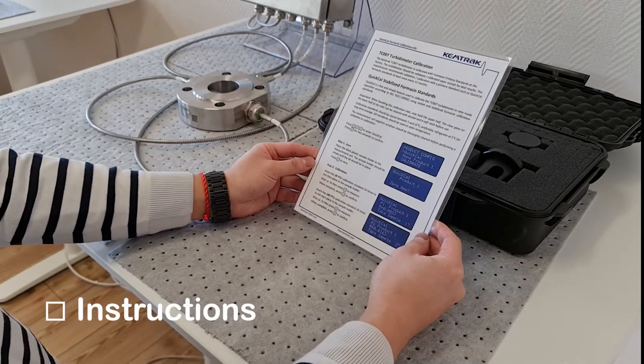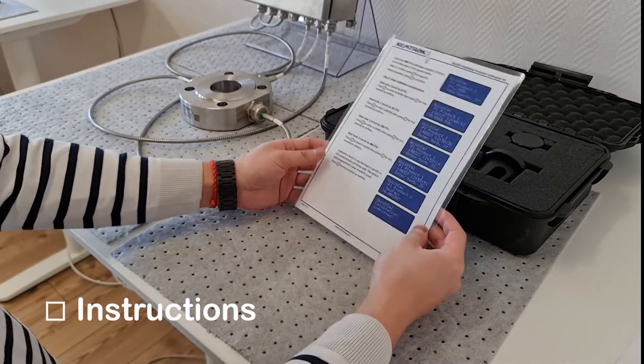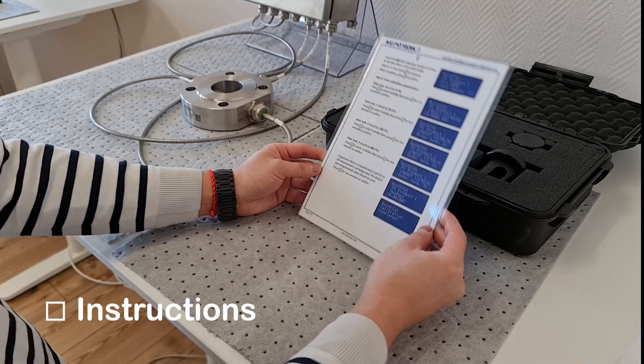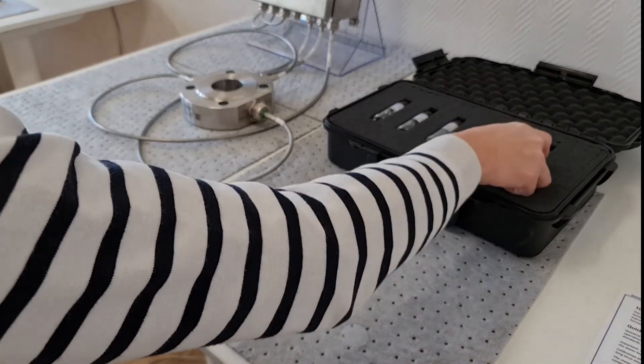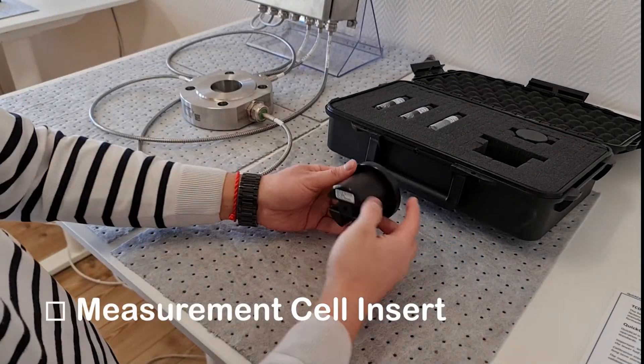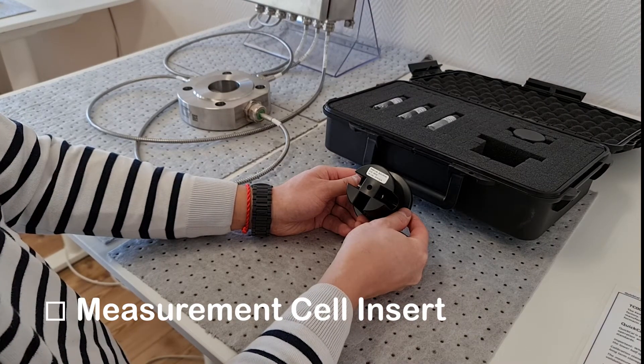The calibration kit comes with a laminated set of instructions that detail how to perform the calibration. The next item is a plastic measurement cell insert that is matched to the size and type of measurement cell it will calibrate.